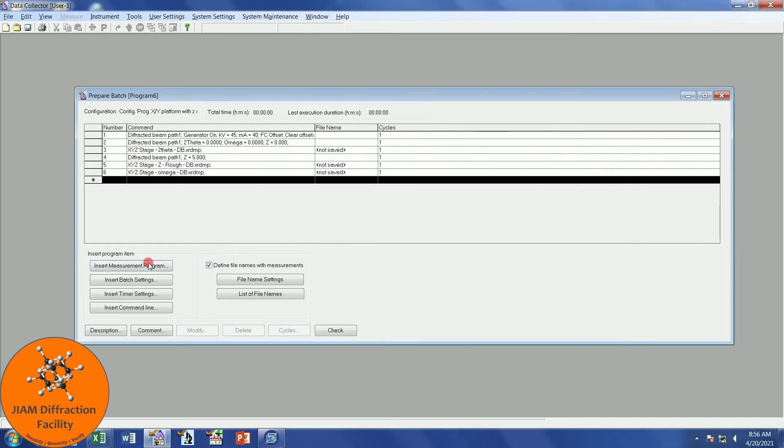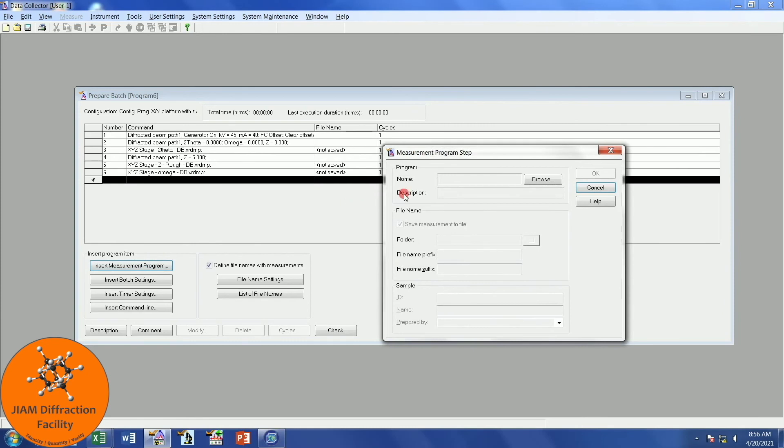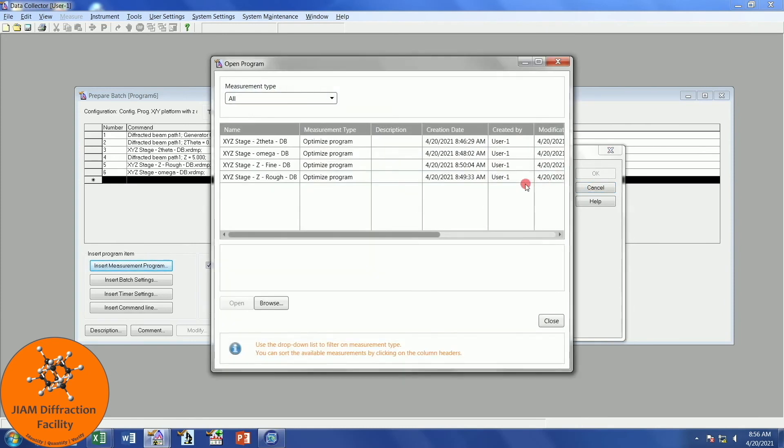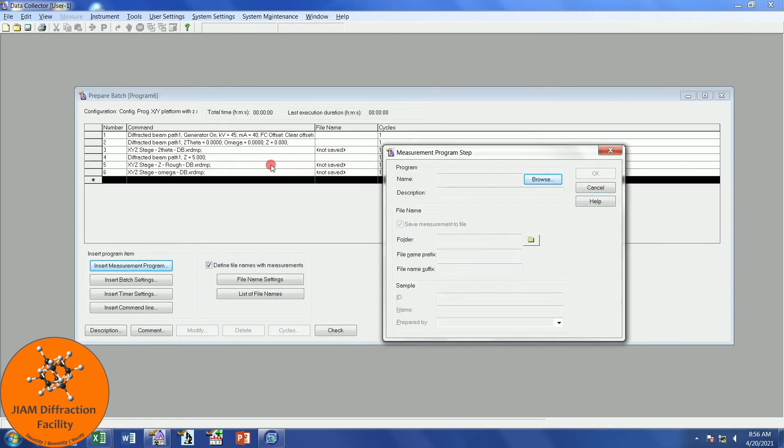Finally, one last measurement program. Browse. We want to choose our Z-fine. Double-click, uncheck, and OK.